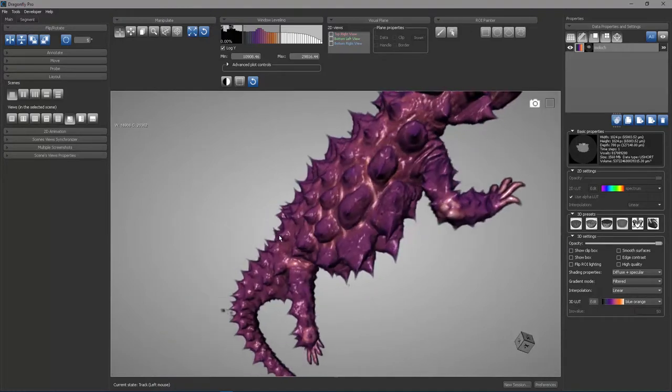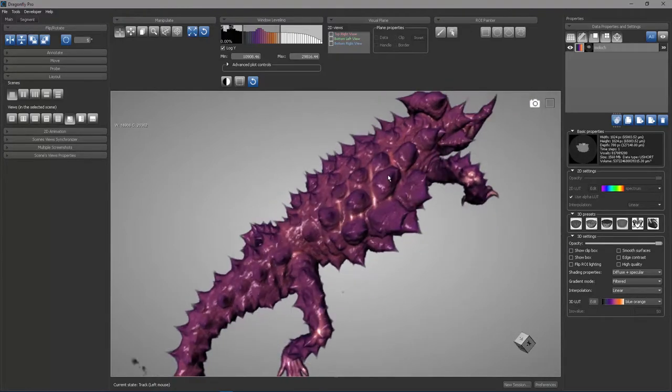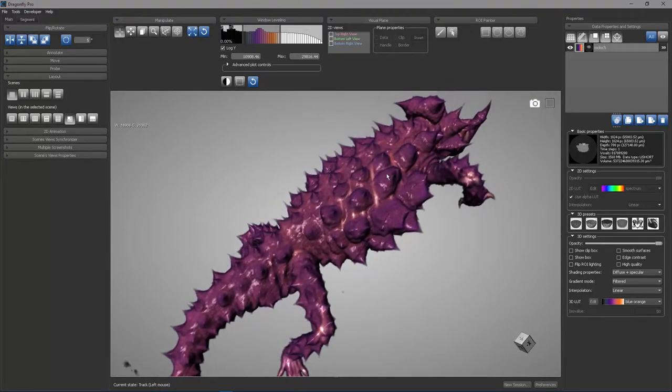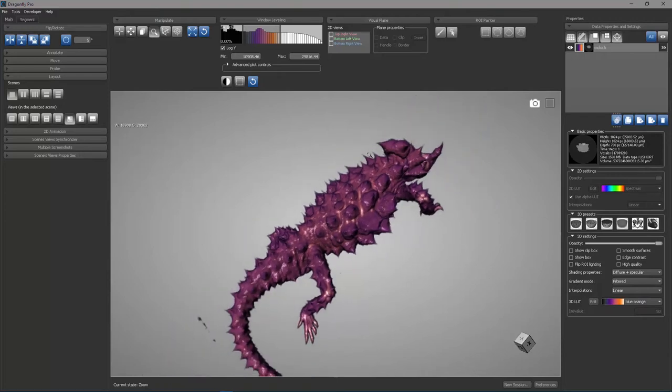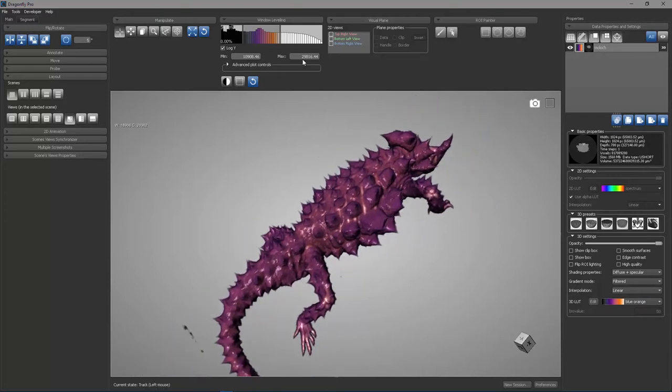So that concludes this discussion of lookup tables. The important thing to remember is that the lookup table for 2D and 3D are independent, and they are managed separately, just like window level settings are managed separately. Thank you.